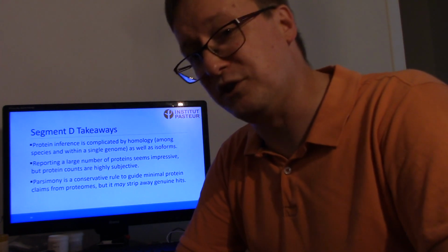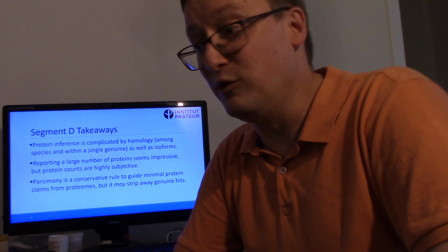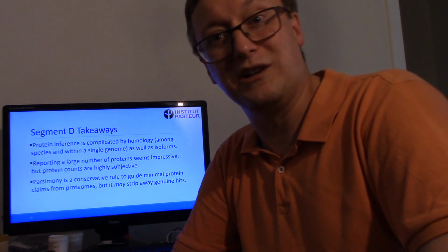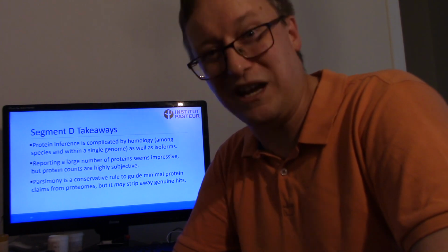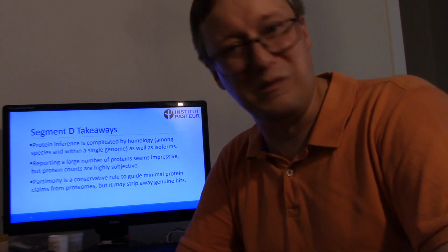I hope it's useful to you, because at this point, segments E and F are moving in a really different direction. They're going to start talking about the fun of quantification in shotgun proteomics. So hold on to your hat, it's going to be a wild ride.